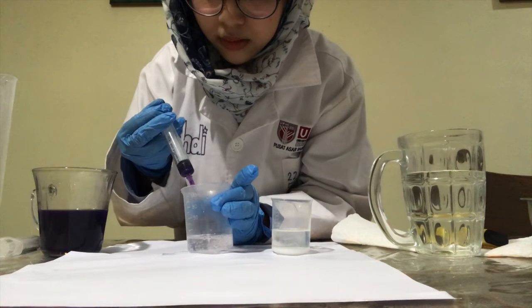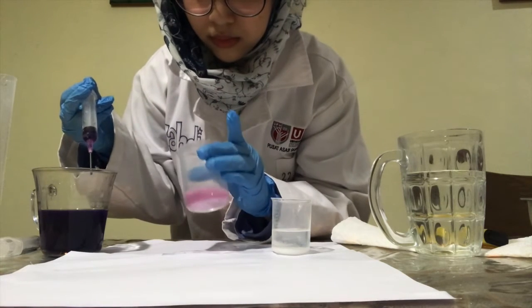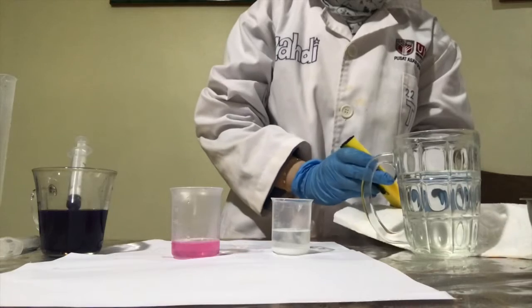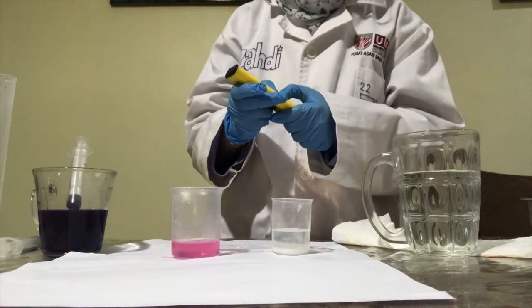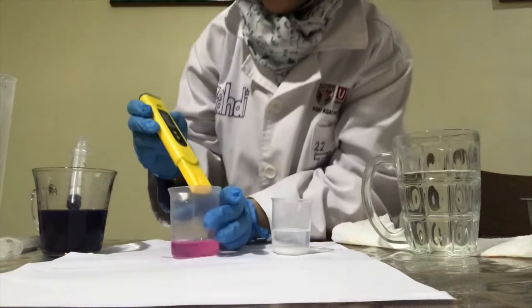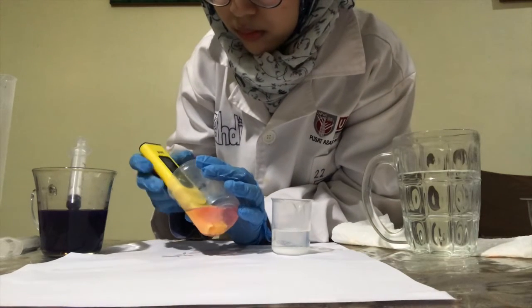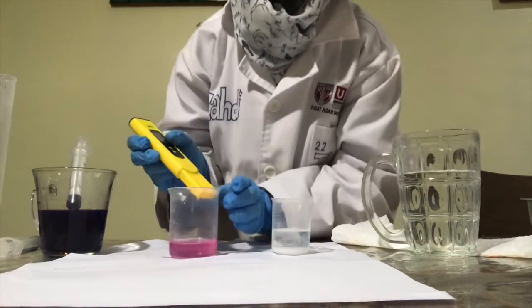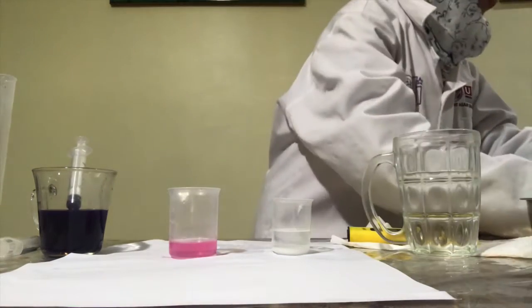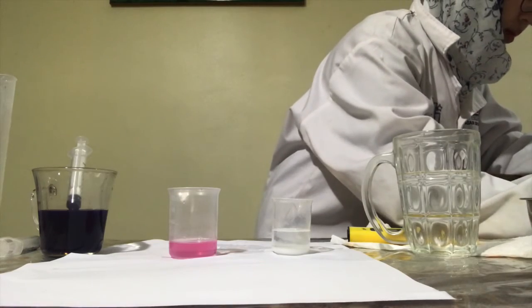Add in some drops of the pH indicator to indicate the color of the vinegar. Then, by using a pH meter, measure the pH of the vinegar. The pH meter electrodes needs to be cleaned between each use to prevent contamination of the substances being measured. Then, record the initial pH of the analyte or the vinegar.